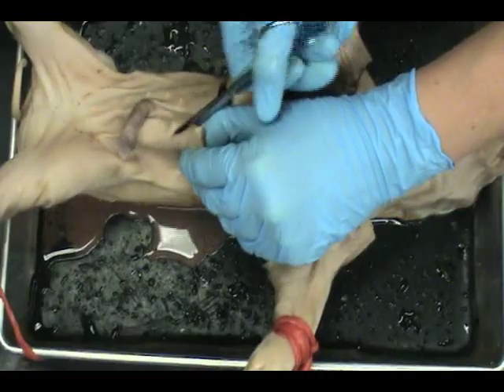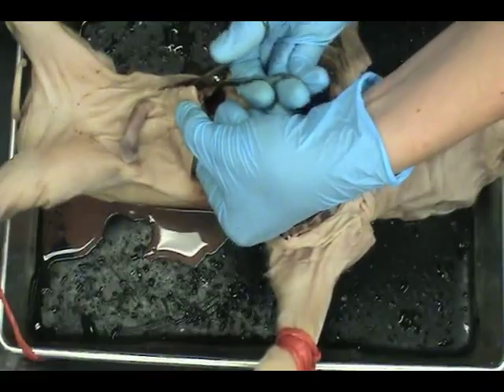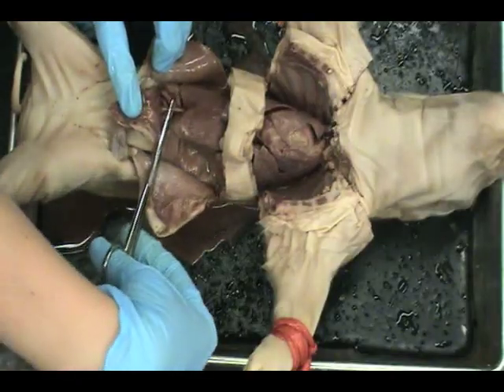From your lowest incision point, snip around the outside of the nipples. Before you can cut any further, pick up the umbilical cord and snip the vein that connects to the liver.